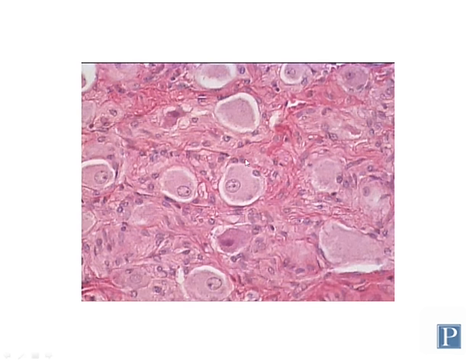There are also numerous satellite cells surrounding the cell bodies of these neurons, but notice there are not as many satellite cells, and that's because there's really not as much room, because much of the space here is occupied by all the different dendrites and axons from these neurons, so that takes up a lot of space. Pseudo-unipolar neurons only have a single dendrite instead of many, and so you don't have quite as much other neural tissue occupying the space here.